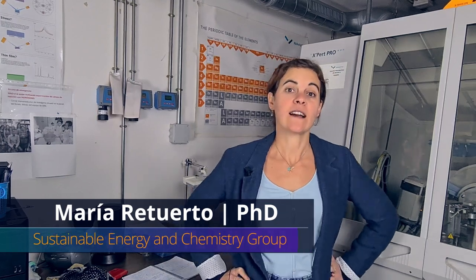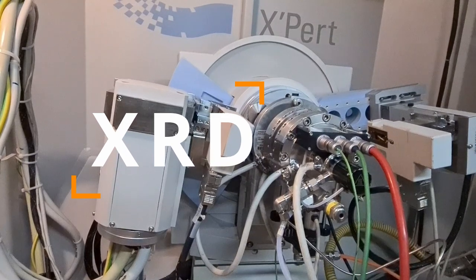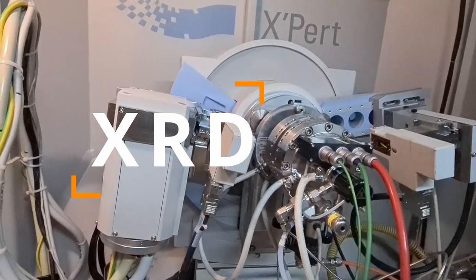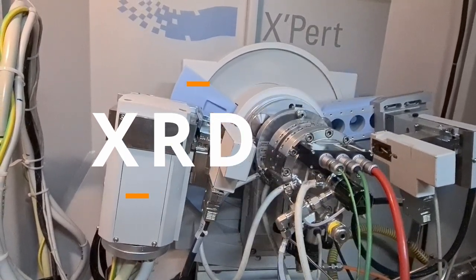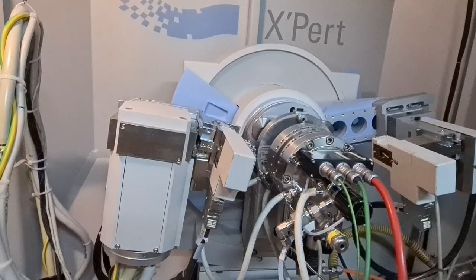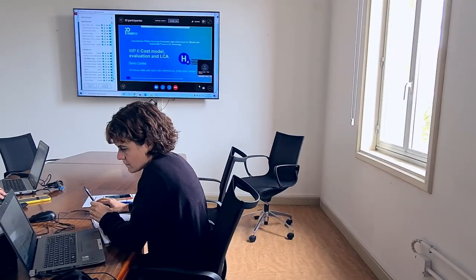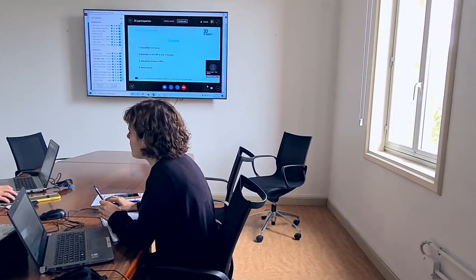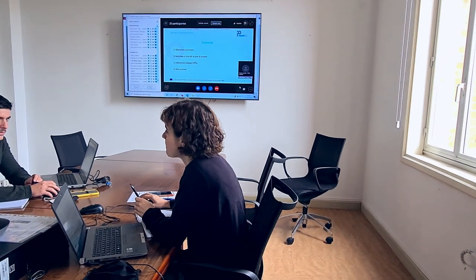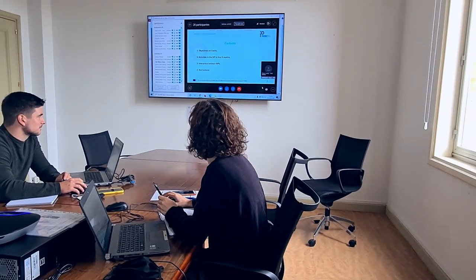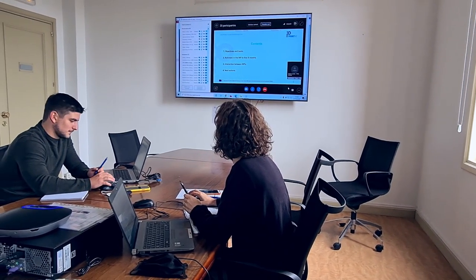X-ray diffraction is a characterization technique used for phase identification. We use this technique to determine the phases, the purity, and the crystal structure of each phase present in a catalyst. In the frame of the European project FLEDGE, we use this technique to determine the percentage of each phase and also the cell parameters, crystal structure, and the crystalline domain size of each phase in the catalysts.